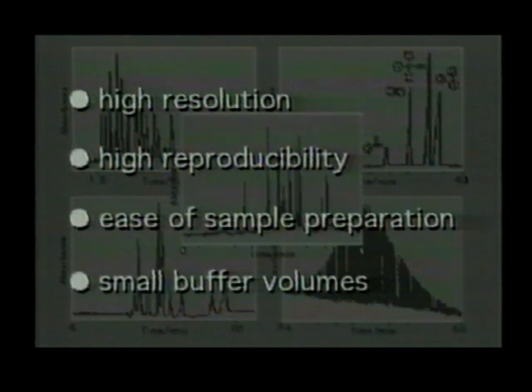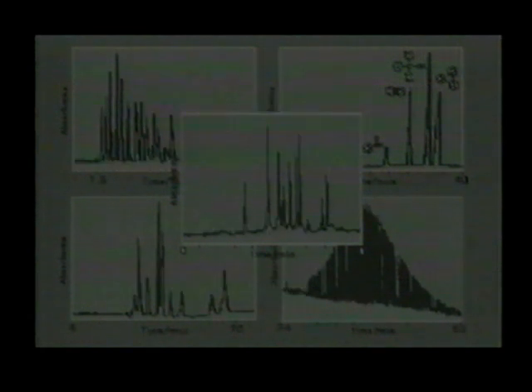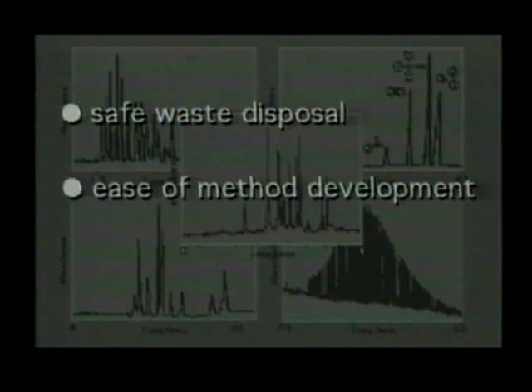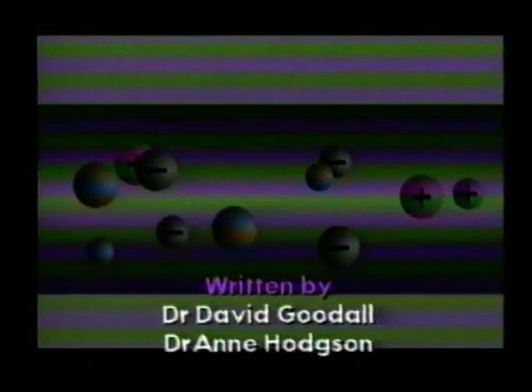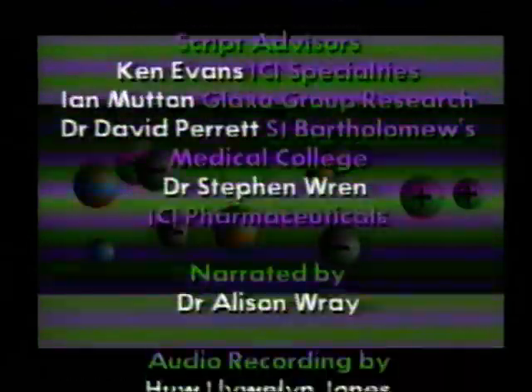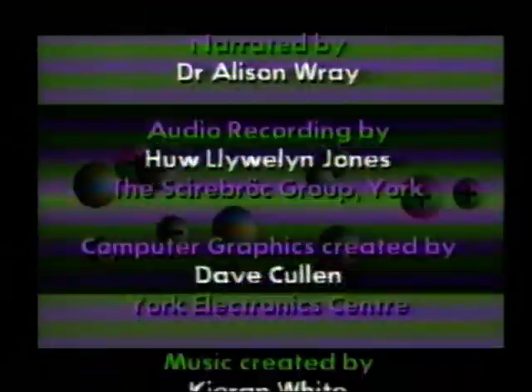What is more, CE offers advantages over other separation techniques in the ease of sample preparation and in the use of small volumes of running buffer. Compared to the use of organic solvents as eluents in HPLC, these aqueous solutions present virtually no hazard in their handling and disposal. Other advantages include ease of method development and low running costs.